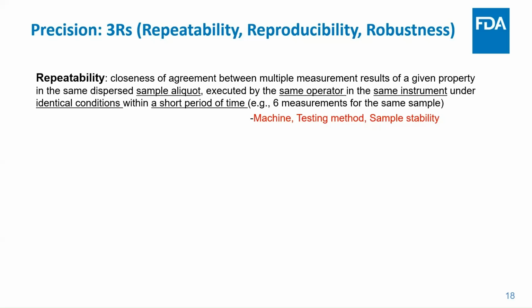That can mean that we either run too long or too short, or the condition is not proper, so the sample is undergoing some changes during the measurement. That typically leads to the third one, that the sample has some stability issue, that as a function of time the sample is actually undergoing changes.